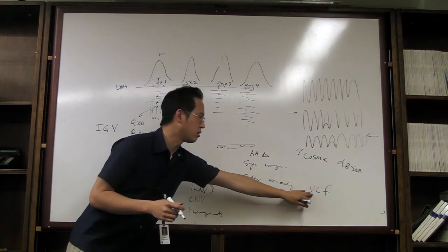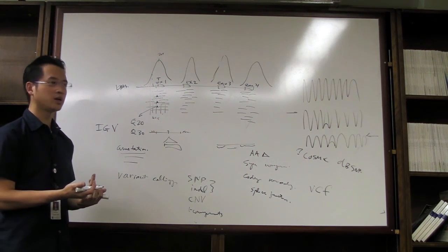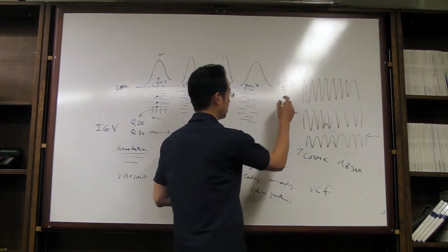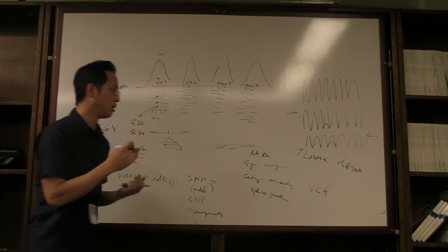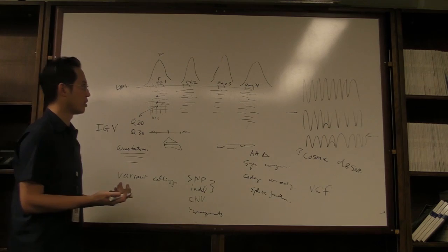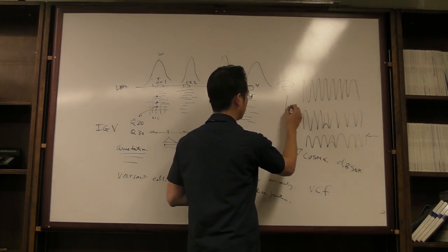So now that you get the variant call file out, well annotated, you need to filter. Because you're going to get things where I have very low coverage, and my sequencing is very erroneous. So let's say half of these reads here show a C, and half show a G.